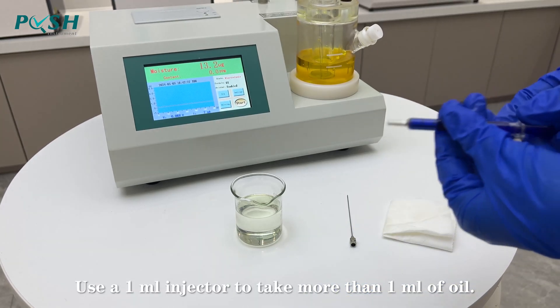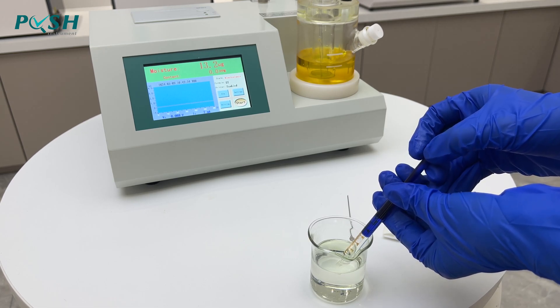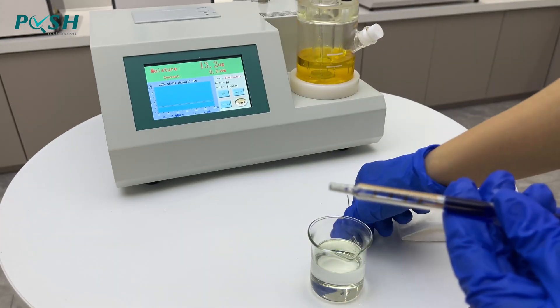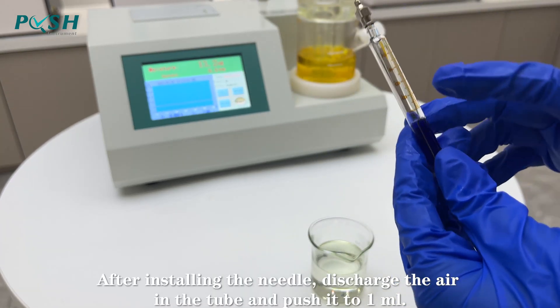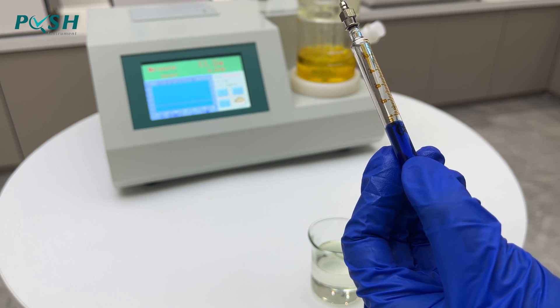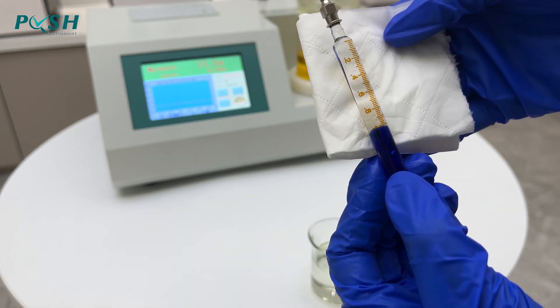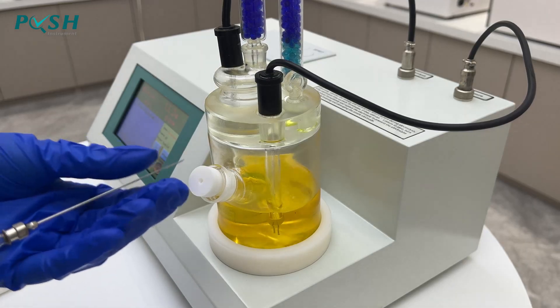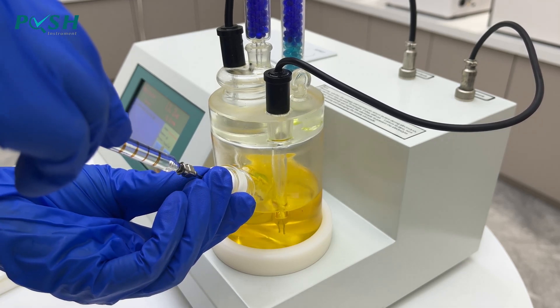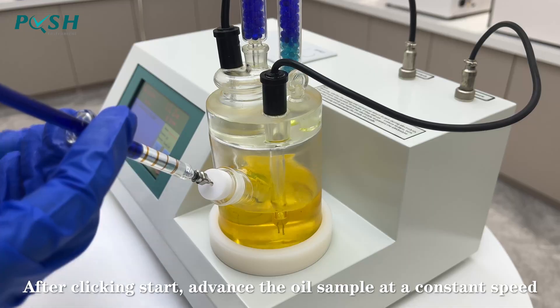Use a 1 ml injector to take more than 1 ml of oil. After installing the needle, discharge the air in the tube and push it to 1 ml. Push the needle below the liquid surface. After clicking start, the needle will be removed from the liquid surface; advance the oil sample at a constant speed.